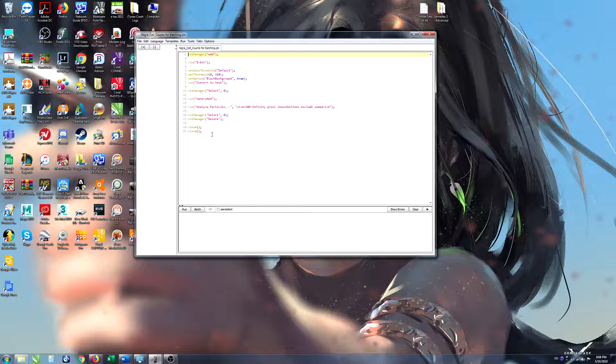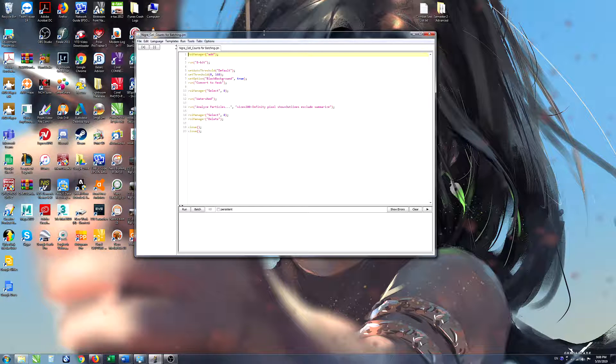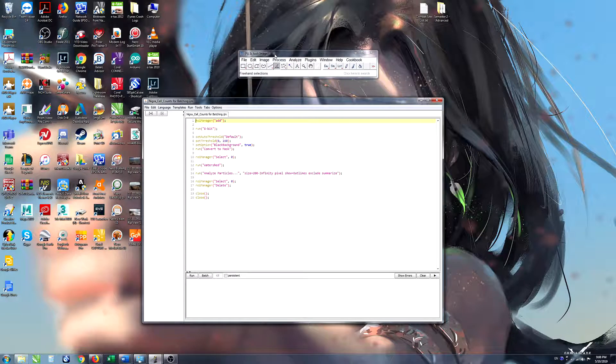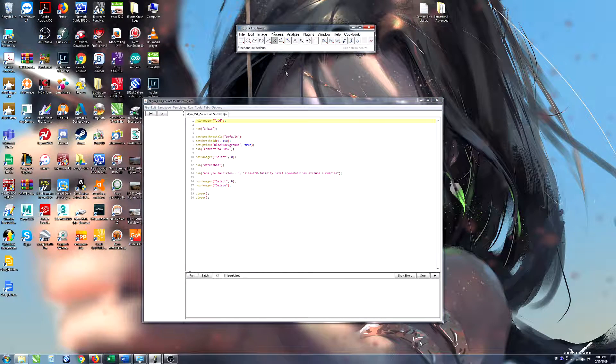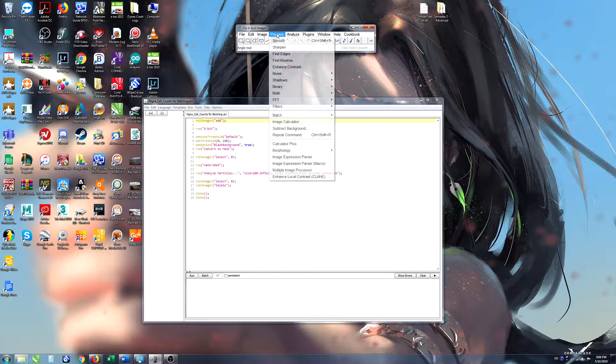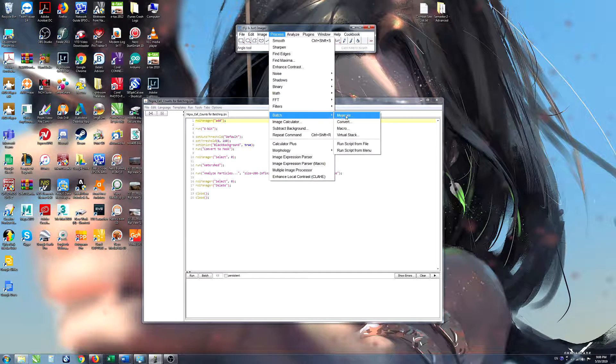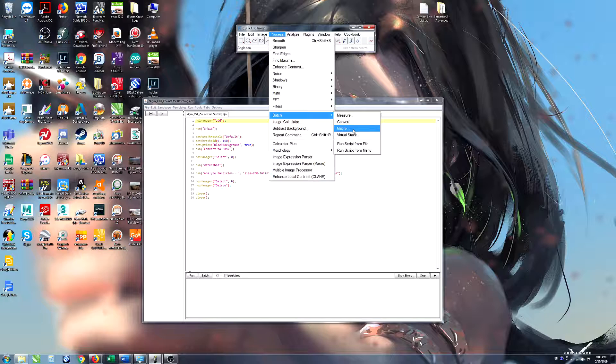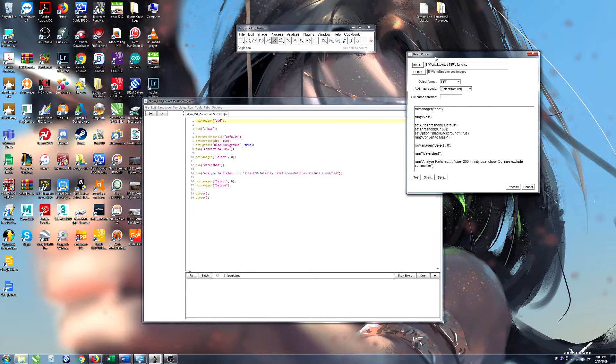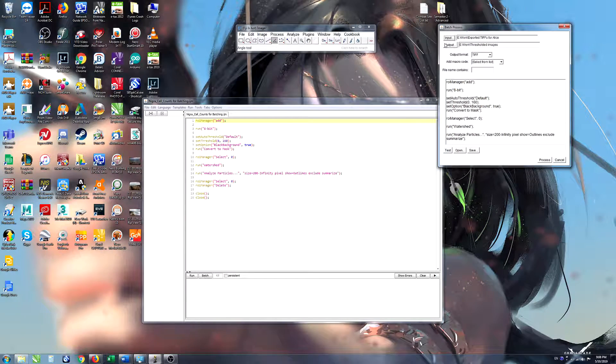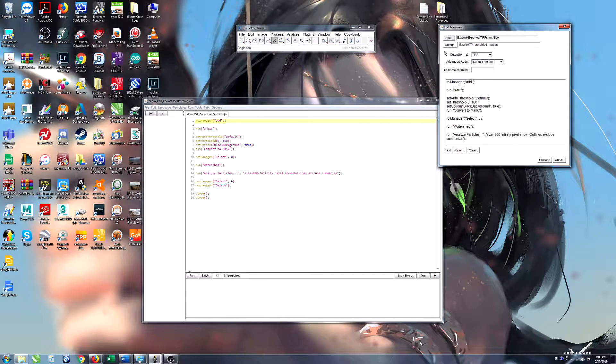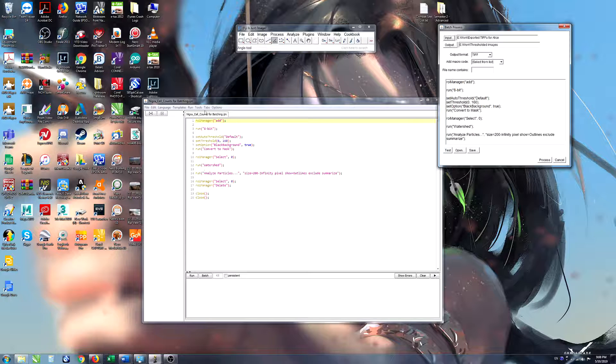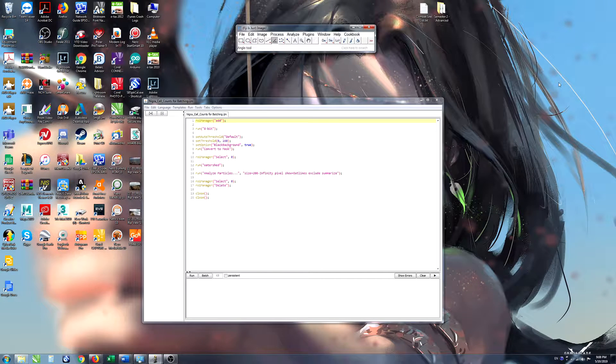Now some of the processes get taken care of by the batching process in ImageJ. So under Process and Batch, remember we clicked on Macro. This batch process is a function of ImageJ and that takes care of opening each of the subsequent images. So we didn't need to specify any of that in the actual macro. So we'll ignore that bit.